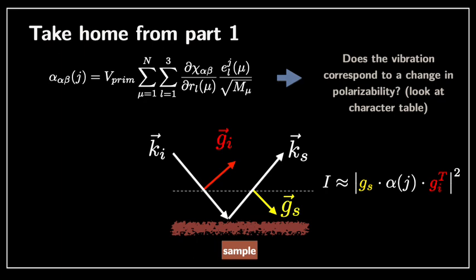We discussed in particular that we can use the character table that describes the symmetry of the material or the molecule we are looking at, to see which mode, if we know its irreducible representation, is Raman active. And we are going to see another example of that today.